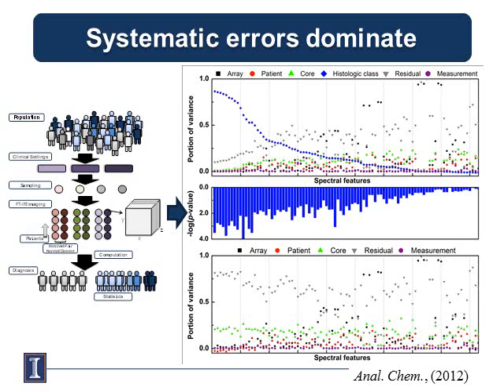And then we saw contributions that were distinct for different spectral peaks arising from different factors, whether they came from different clinics, whether they came from different patients, whether they came from the same patient but different samples. And at the end of all of this, there was one factor that we couldn't explain. It's these gray dots there, or gray inverted triangles. And this factor that we couldn't explain, this residual, which should ordinarily be very, very small, actually started to dominate after a while. It became so prominent that we couldn't even use the data for doing any kind of physiologic monitoring. So the question was, where is this coming from, and what was happening here?